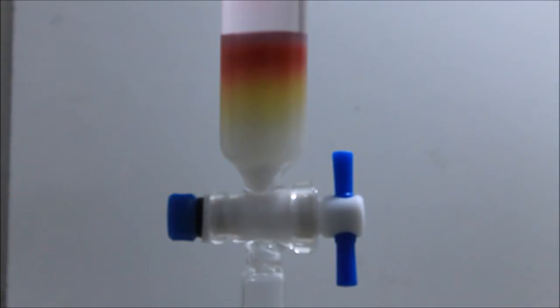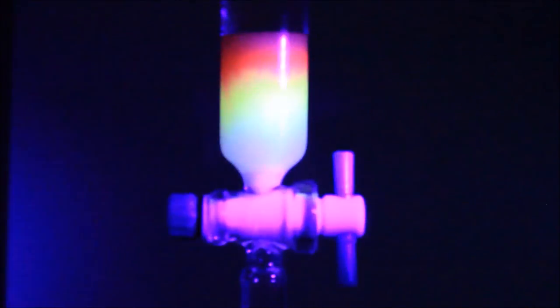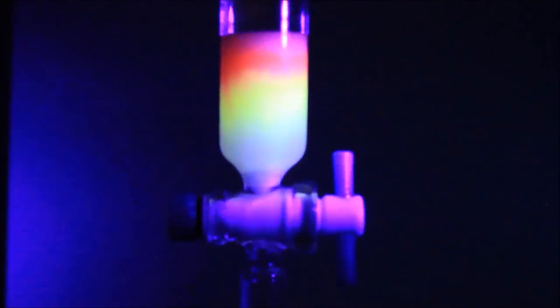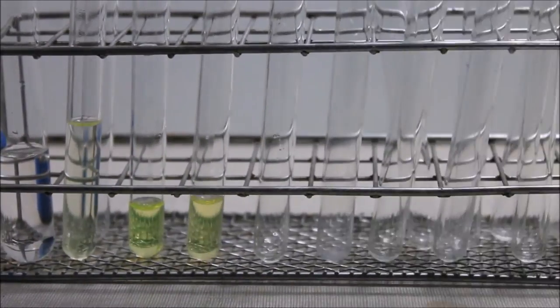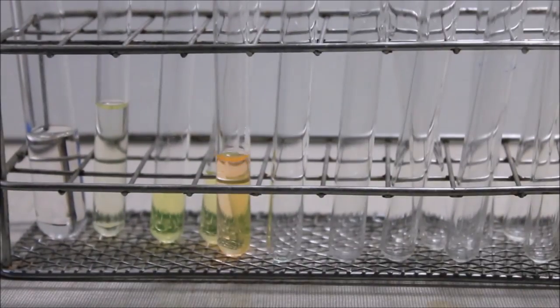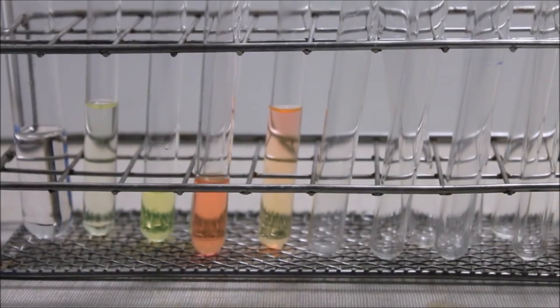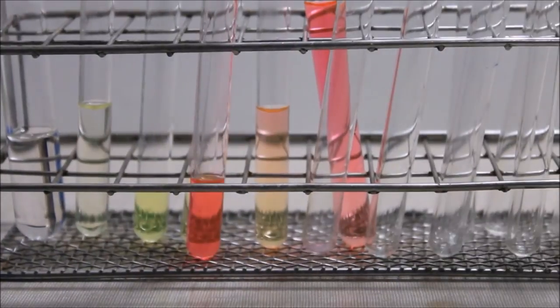You can clearly see how the different dyes spread out through the column at different rates as a function of their polarity. Both compounds are fluorescent; this can be seen under the UV light. Here you can see how the fluorescein is collected in the first tubes and the safranin in the last ones, achieving the separation of the different compounds.